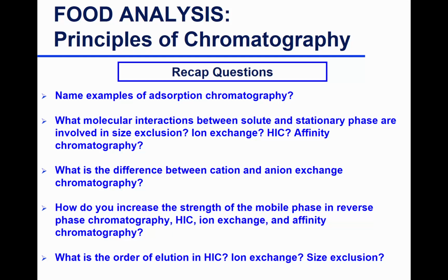Nobody will remember this. You can change the pH or the salt of the solution. That's the non-specific approach, and the specific approach is to add the ligand that attaches. So you change the pH or the salt. That means you're changing the selectivity of the stationary phase to your compound, so they're no longer interacting via a very specific interaction.